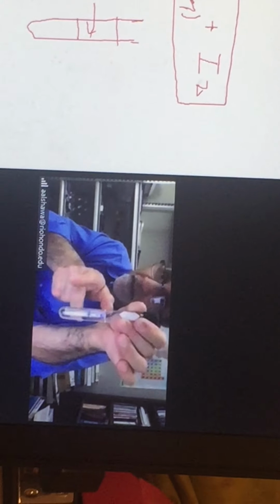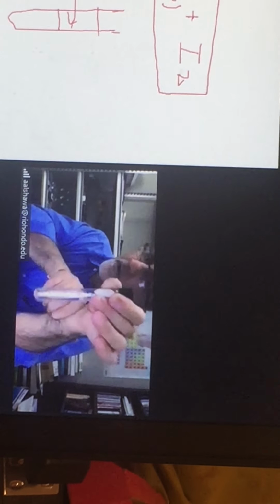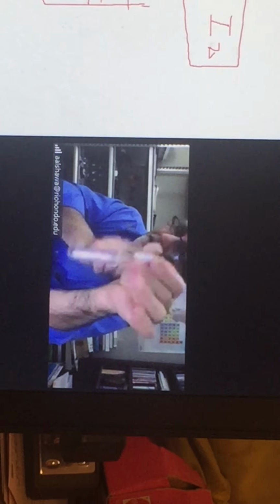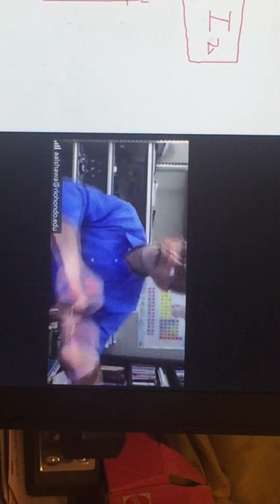If the unknown is bromide, the organic top layer will turn orange, rusty color. If you have iodide, the top layer will end up pink. If you start with chloride, the top layer is clear. So it turns out the chlorine test is conclusive. You can quickly tell which halide you have: chloride, bromide, or iodide.